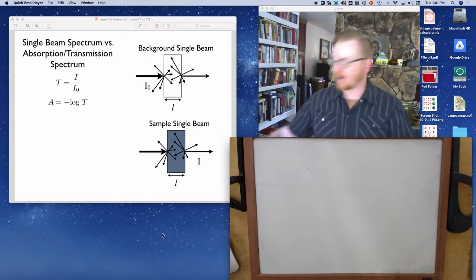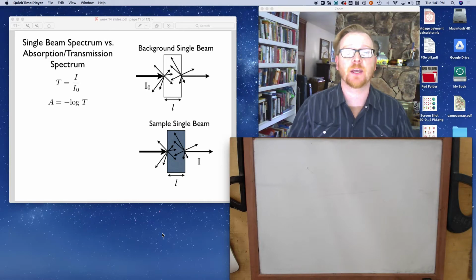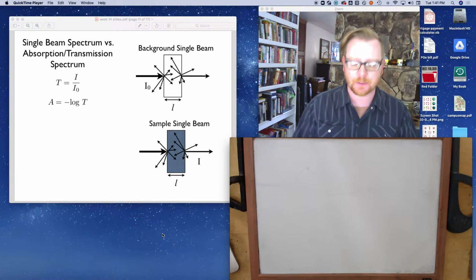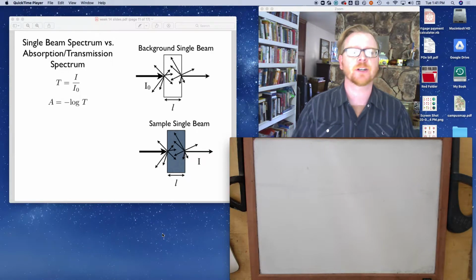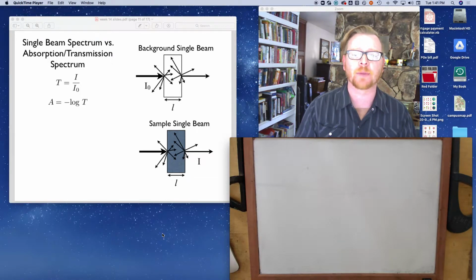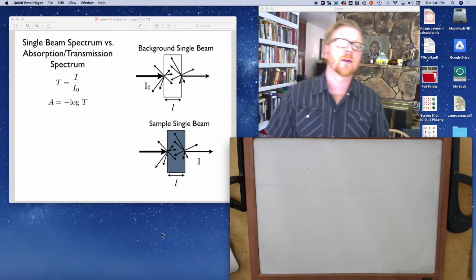Continuing on our discussion of methodologies in spectroscopy, mostly talking about Fourier transform spectroscopy in this lecture, as in the previous lecture. So I'm just going to continue on with these week 14 slides. And so now what I probably want to get into are various applications of spectroscopy.